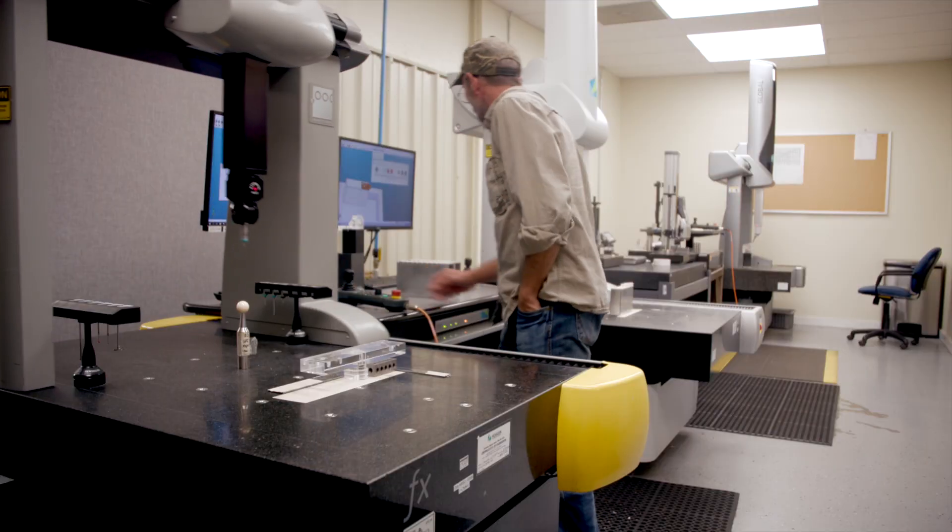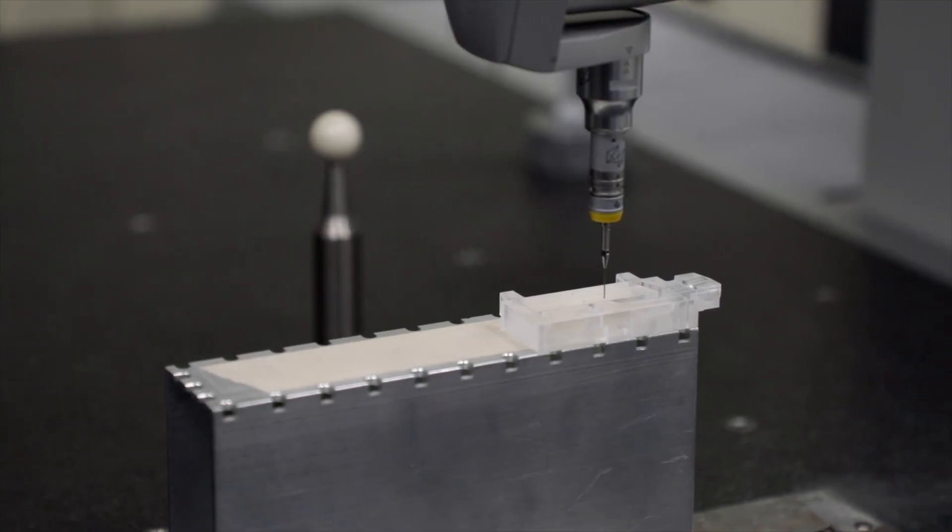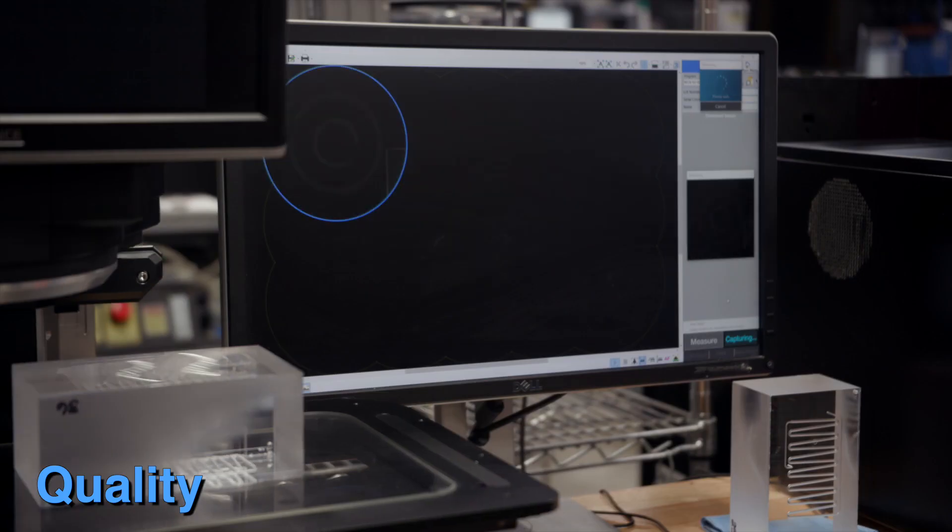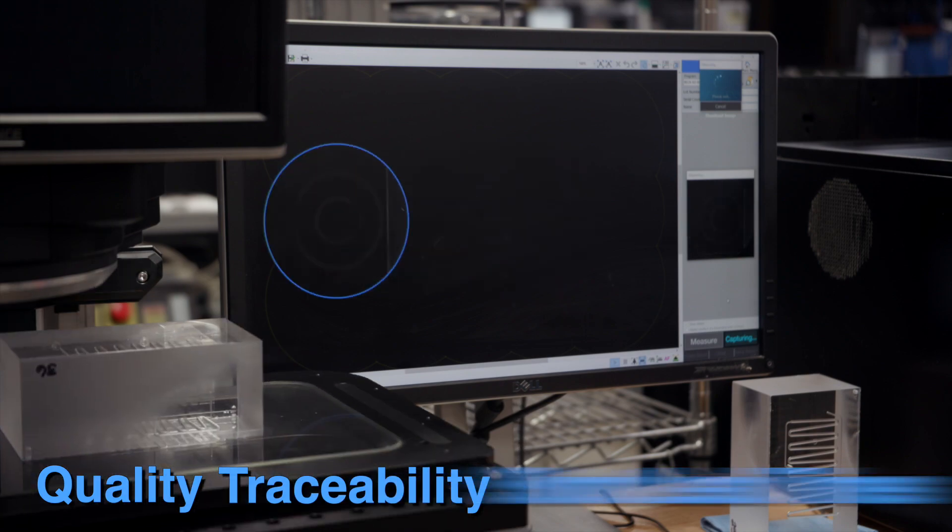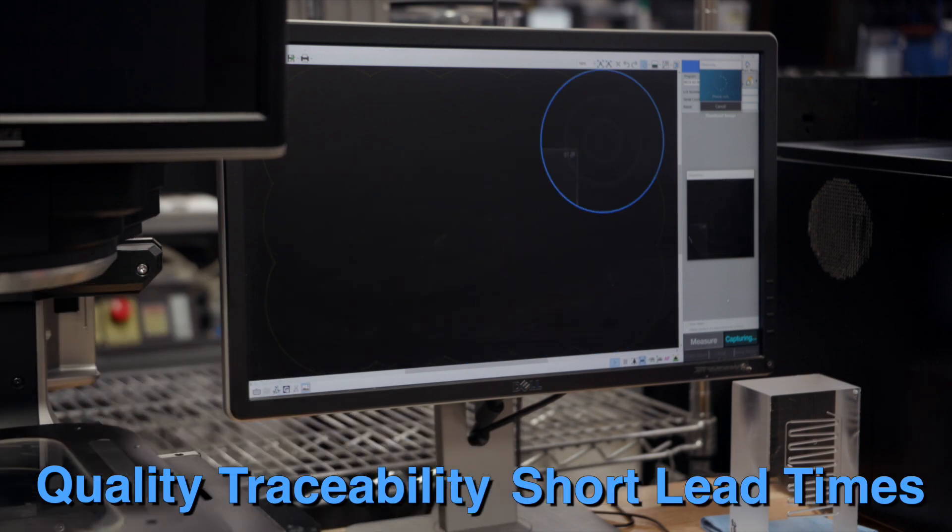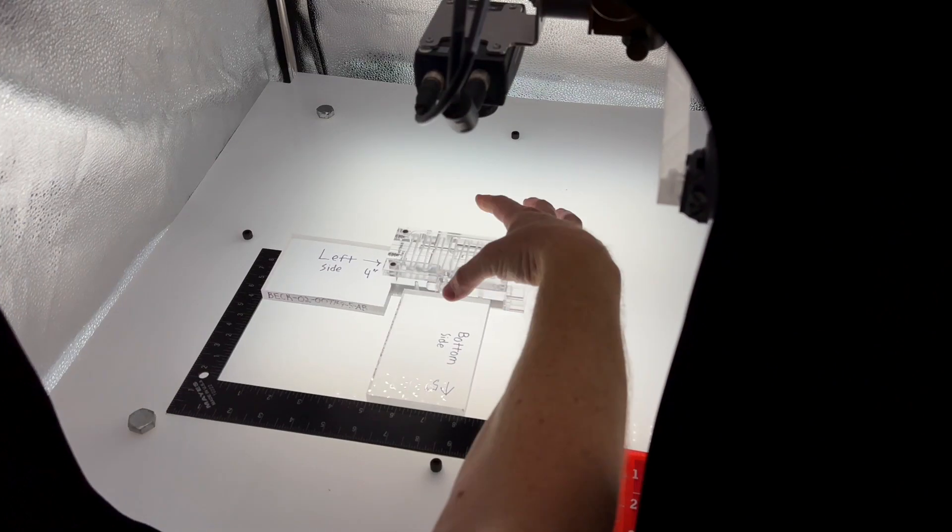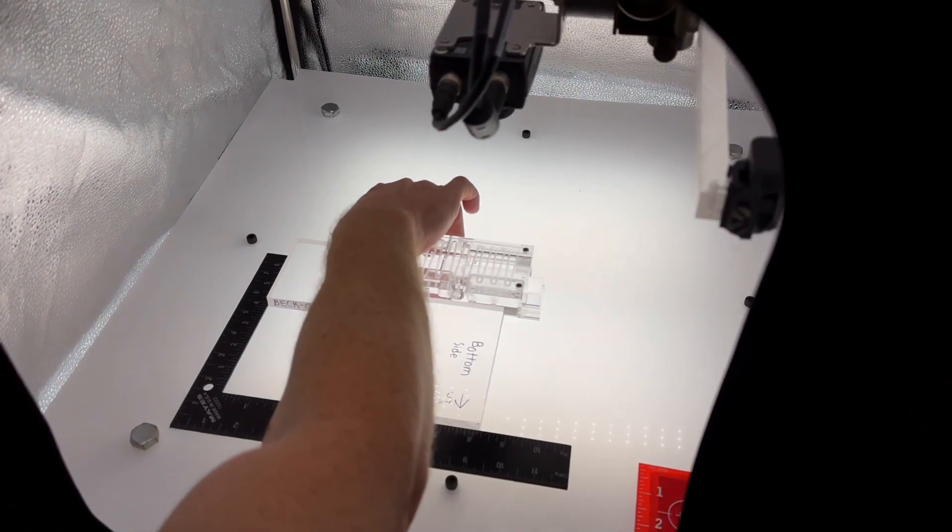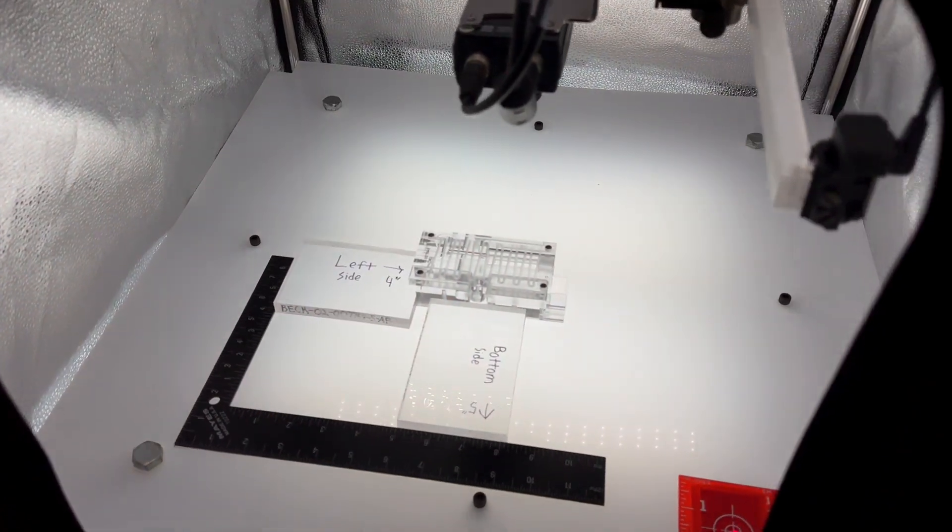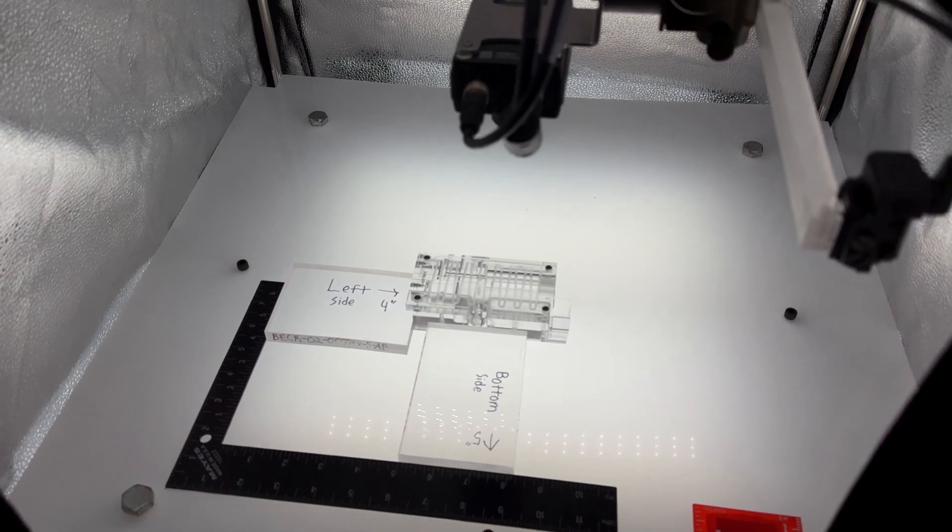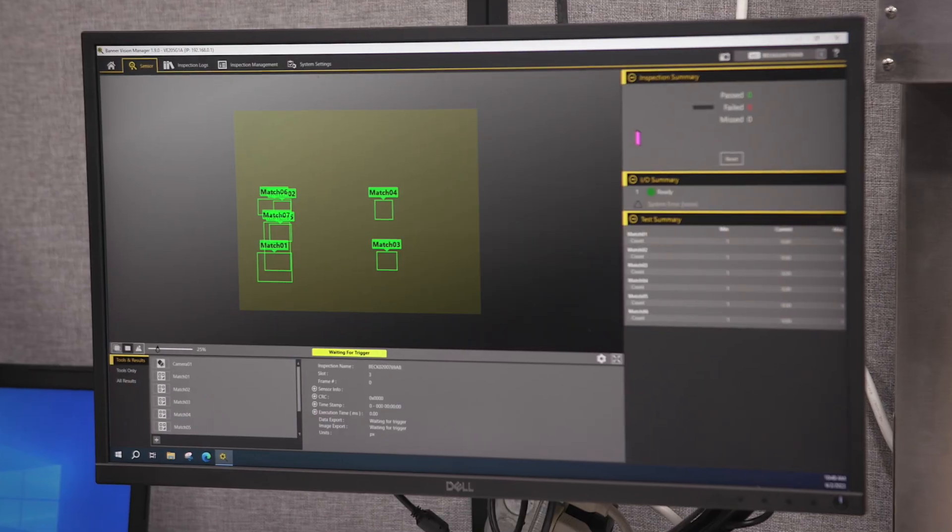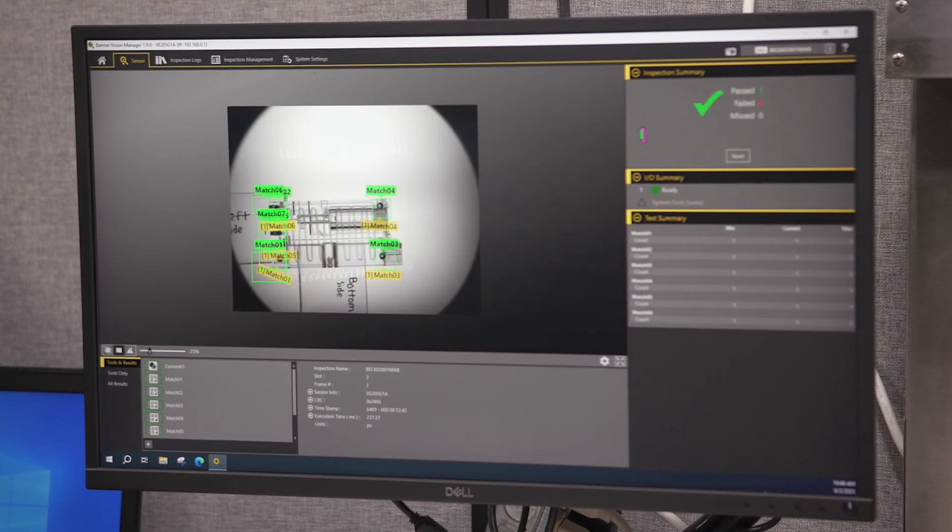Our customers appreciate the manufacturing quality, traceability, and short lead times that keep their supply chain and their projects on schedule, with parts that are certified to meet their specifications.